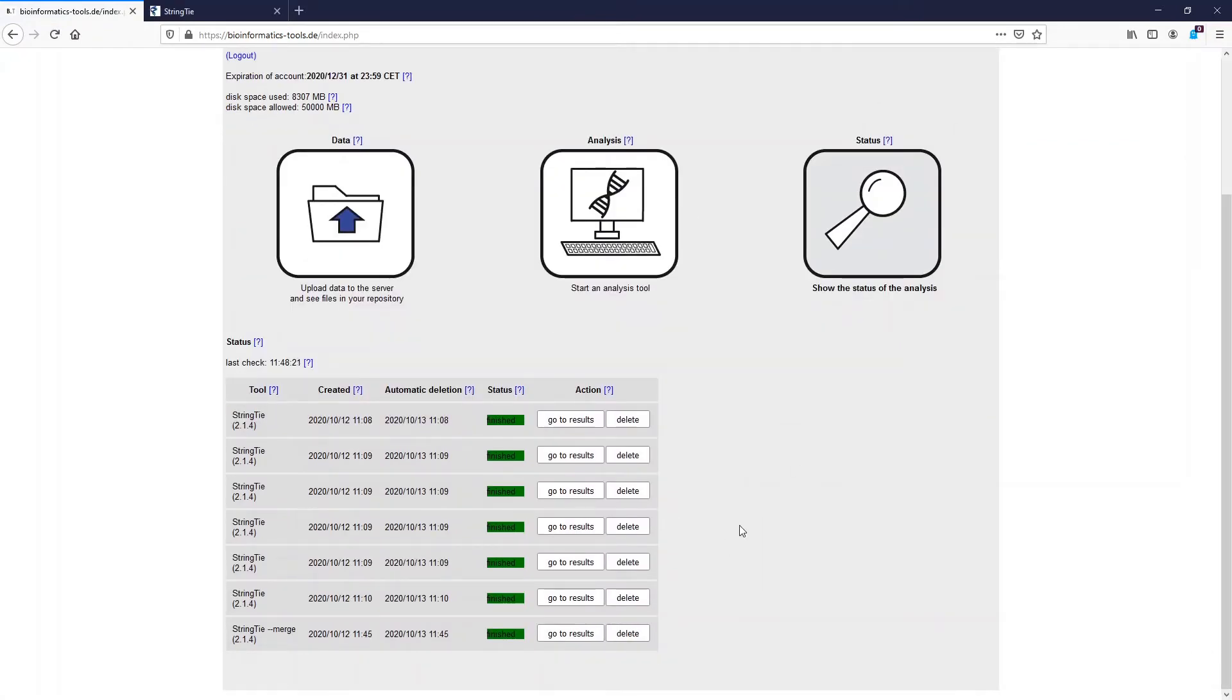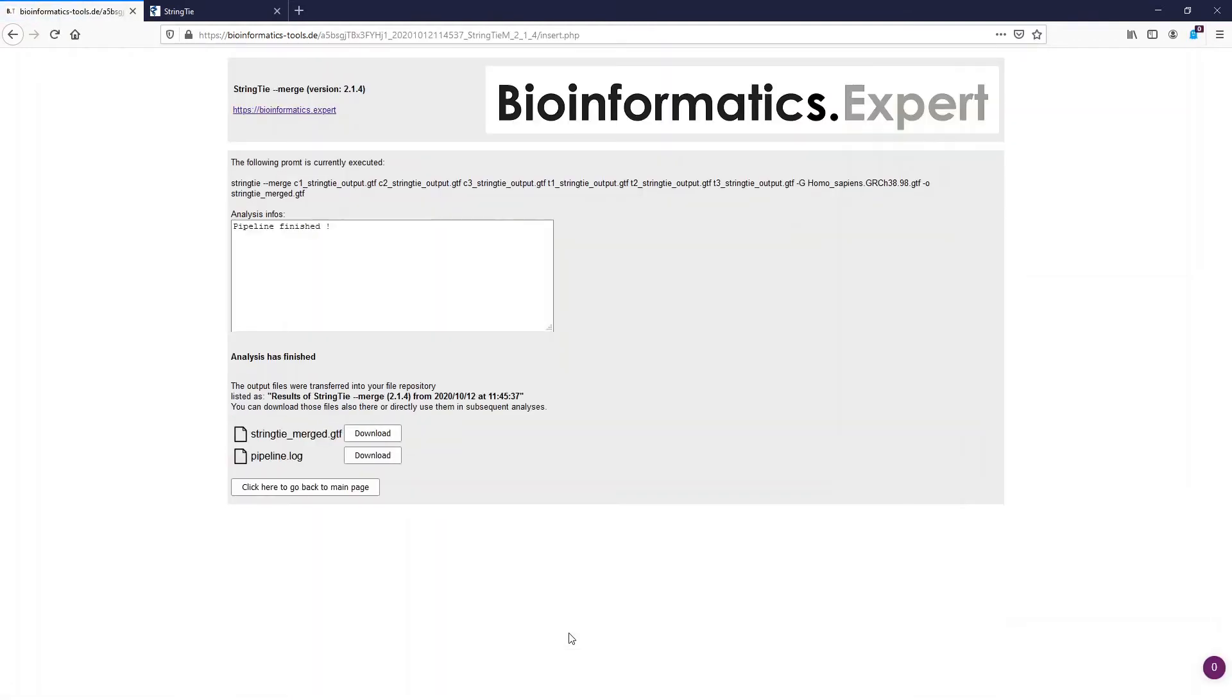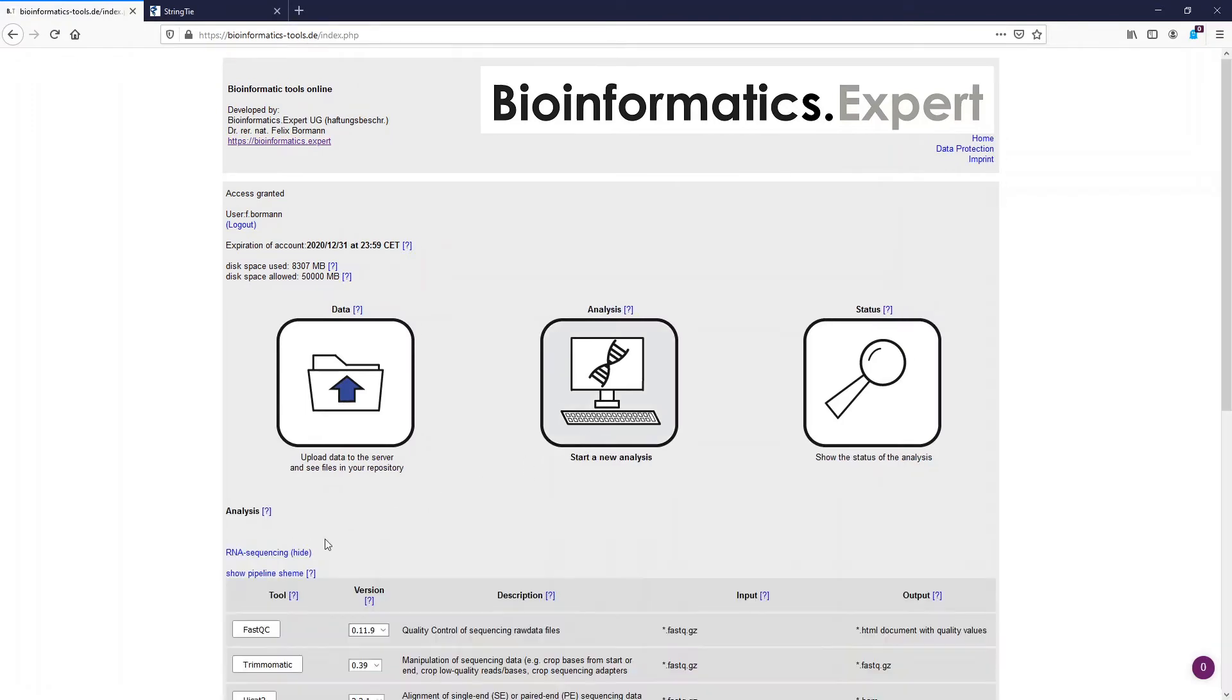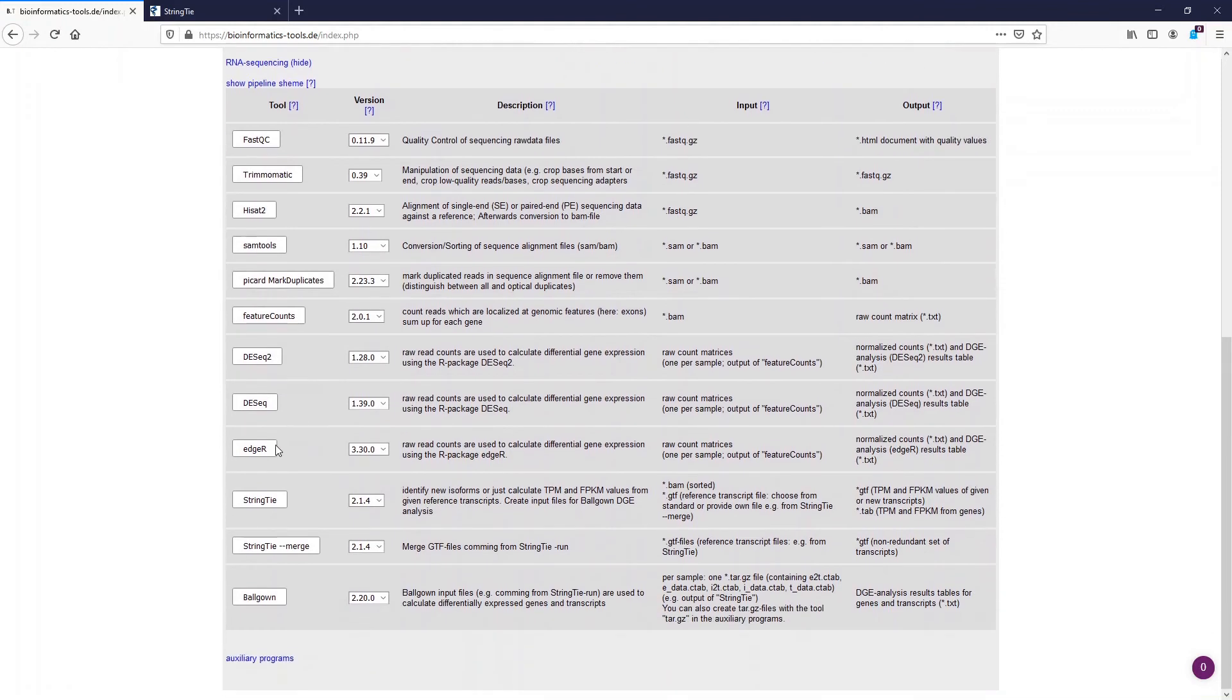After the run has finished we can go to the page and we see that we now have a merged GTF file. With that we can now rerun StringTie to get the TPM and FPKM values for all known but also for the new transcripts, and also get the input files for the Ballgown differential gene expression analysis.